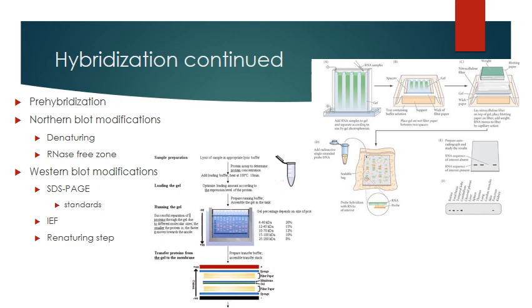Okay. Now, in order to accommodate the fact that denaturing does occur during our purification process, we have to make sure that we include in any Western blot modification a renaturing step where the protein can reform in the proper sense. The key thing is pH. Watch your pH. If your pH is off, your protein's not going to form properly, and then your epitopes are going to be affected. So you might get your protein separated, but you won't have anything available for the binding of our probe.